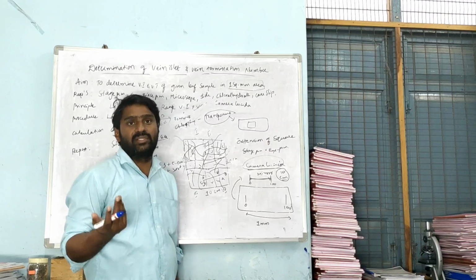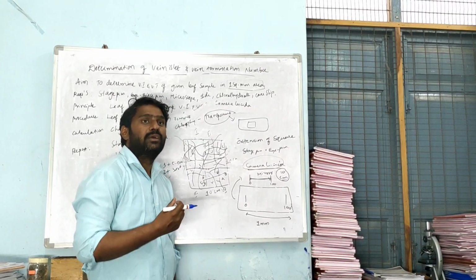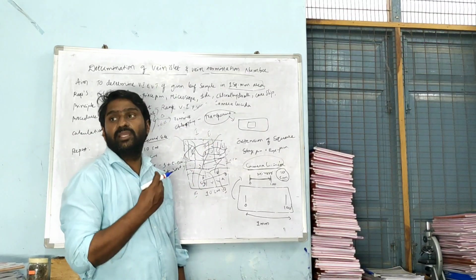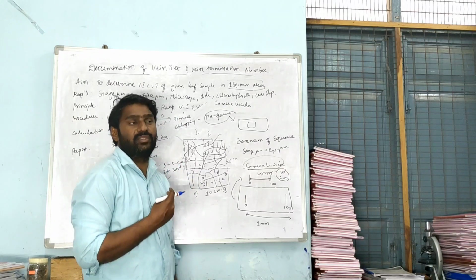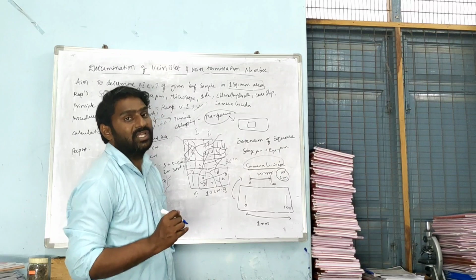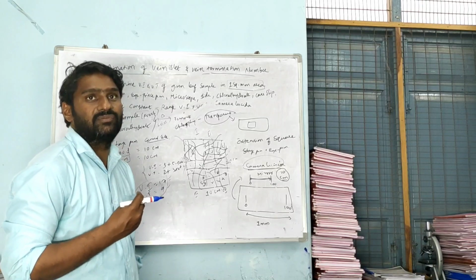Generally, whichever leaf it is, though you may identify it by its external features, it should be confirmed as a genuine leaf by its microscopic characters. In case of these microscopic characters, the initial step used to detect the genuineness of the leaf is the leaf constant, that too in the case of vein islets and vein terminates. So after getting this range of 17 vein islets and 9 vein terminates, which kind of leaf would this be, and what is the sample of the leaf?